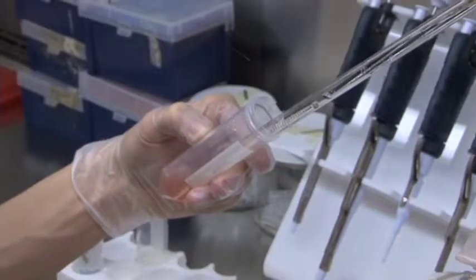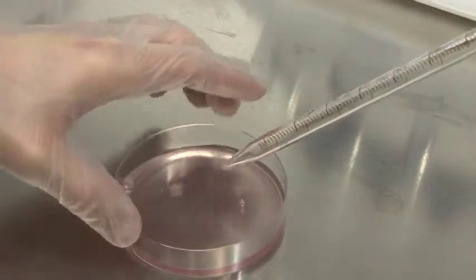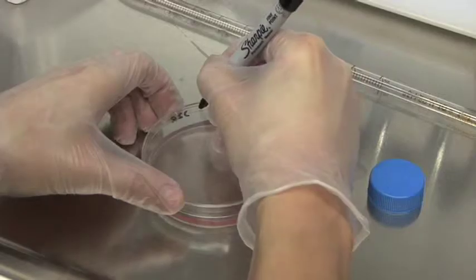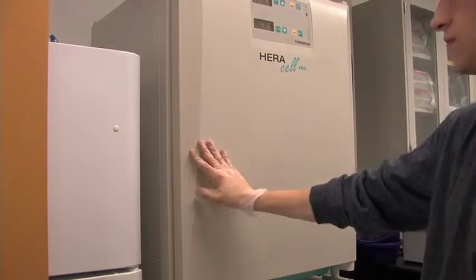The cells are resuspended in nutrient-rich media and are plated onto a clean dish. This mixture contains the things necessary for the cells to continue dividing. The cells are then incubated overnight to mimic their natural environment.